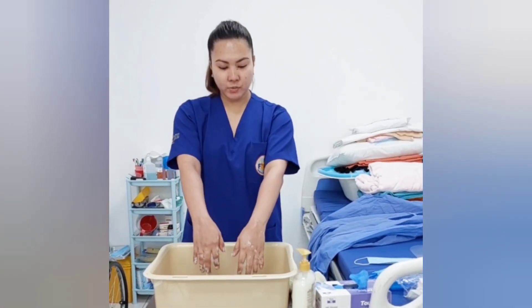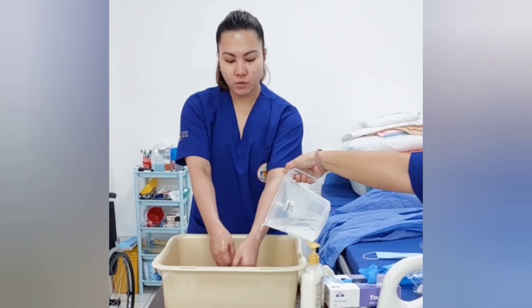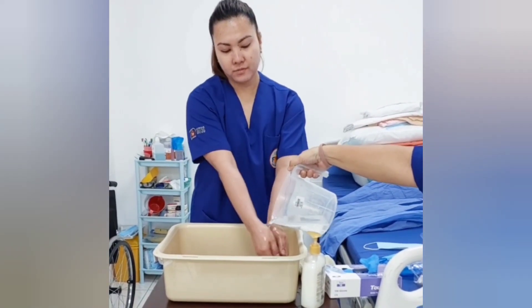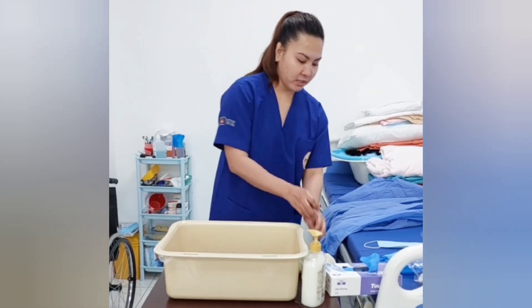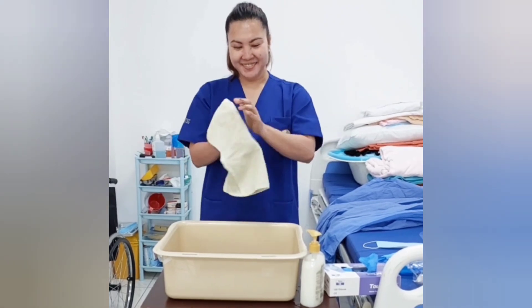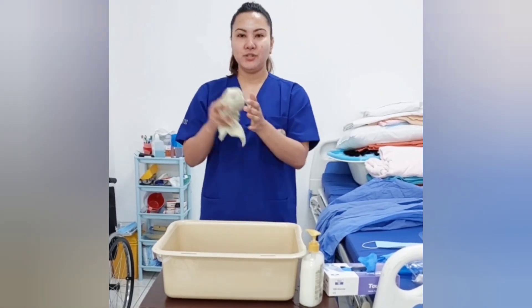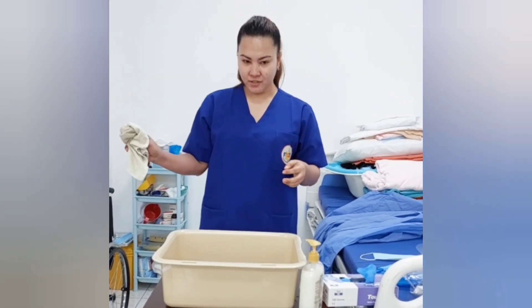Rinse hands with water. Allow water to remove all the soap. Dry hands thoroughly with a single use of towel. Use the same towel to close the faucet, and direct it to the trash can if you are using a tissue.